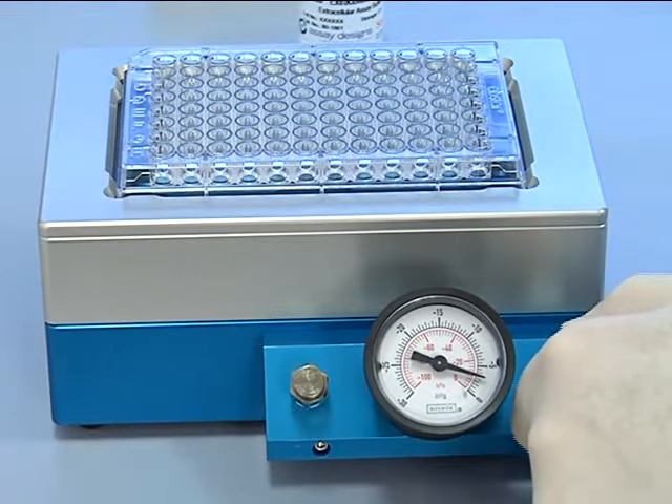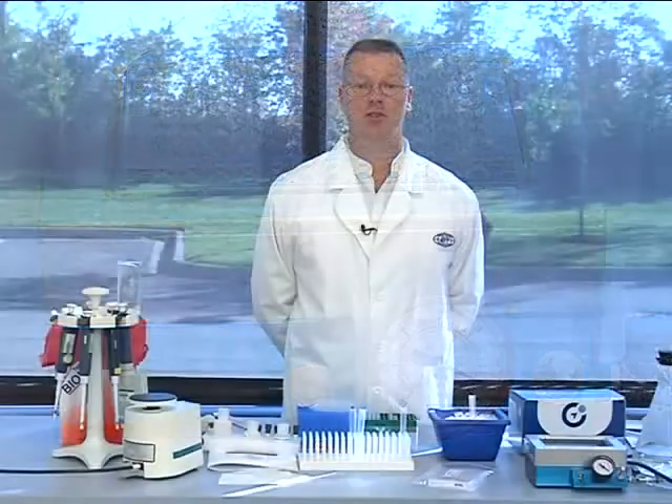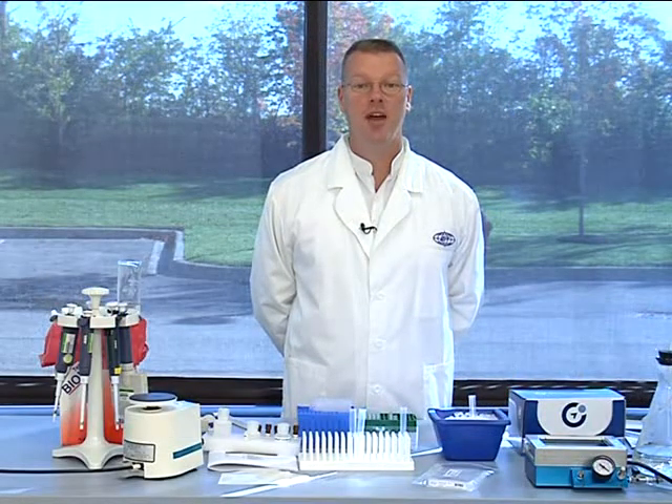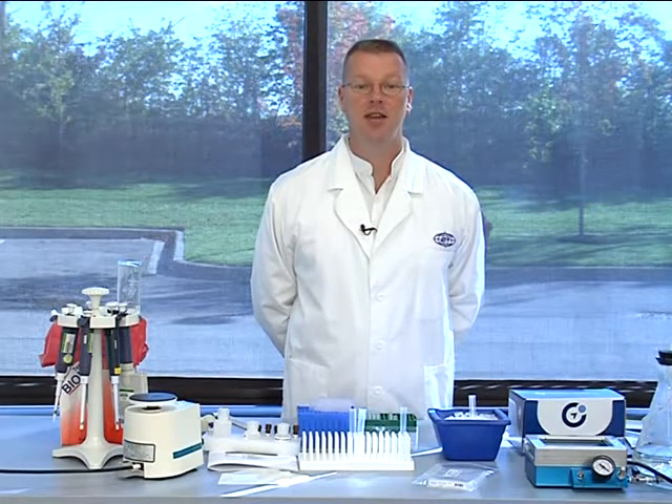If the pressure does not go down far enough, turn the toggle switch again, typically counterclockwise, until the pressure reaches 2 inches of mercury. You have now calibrated your vacuum manifold for the multi-bead assay. The pressure should be maintained throughout the protocol.